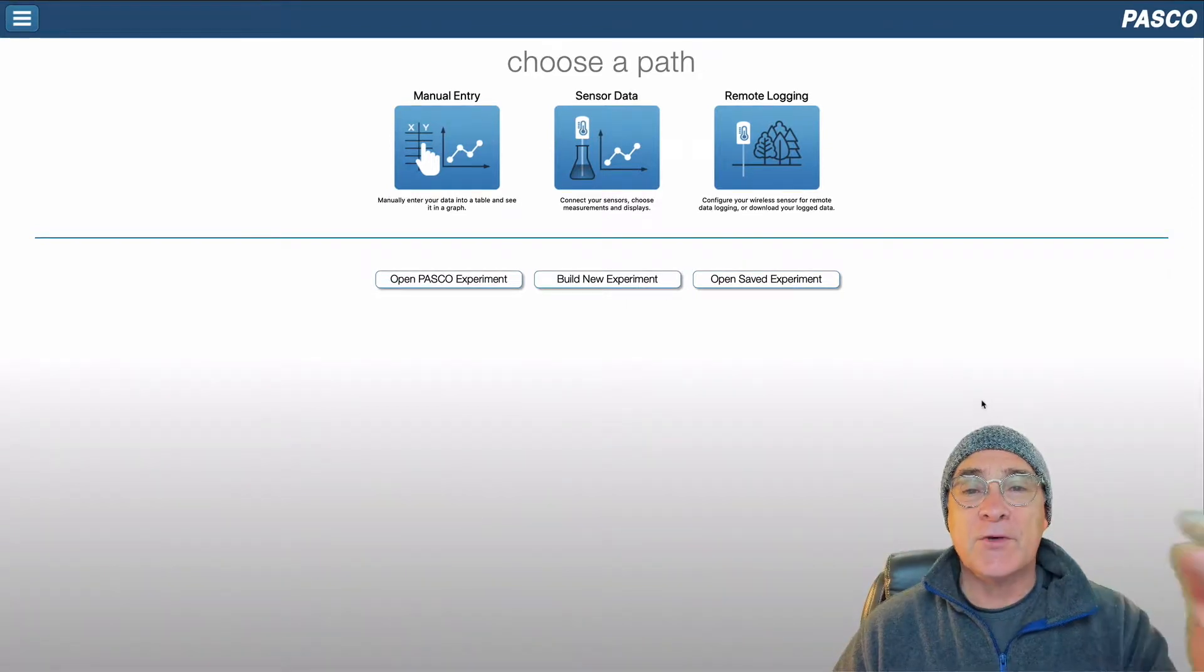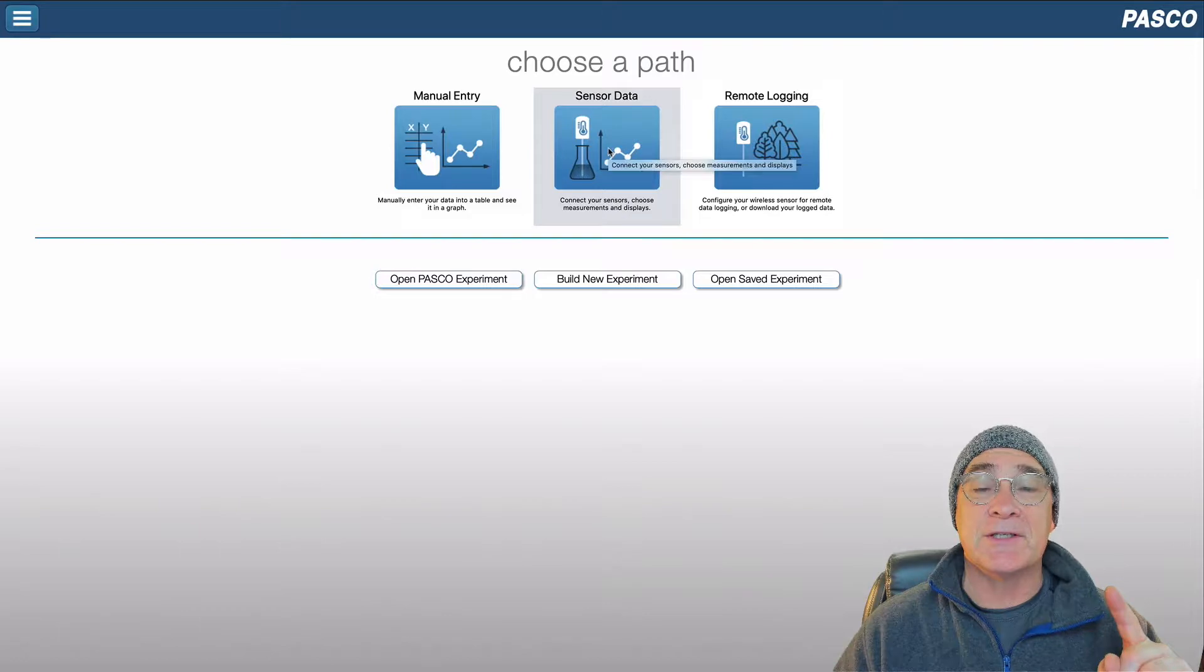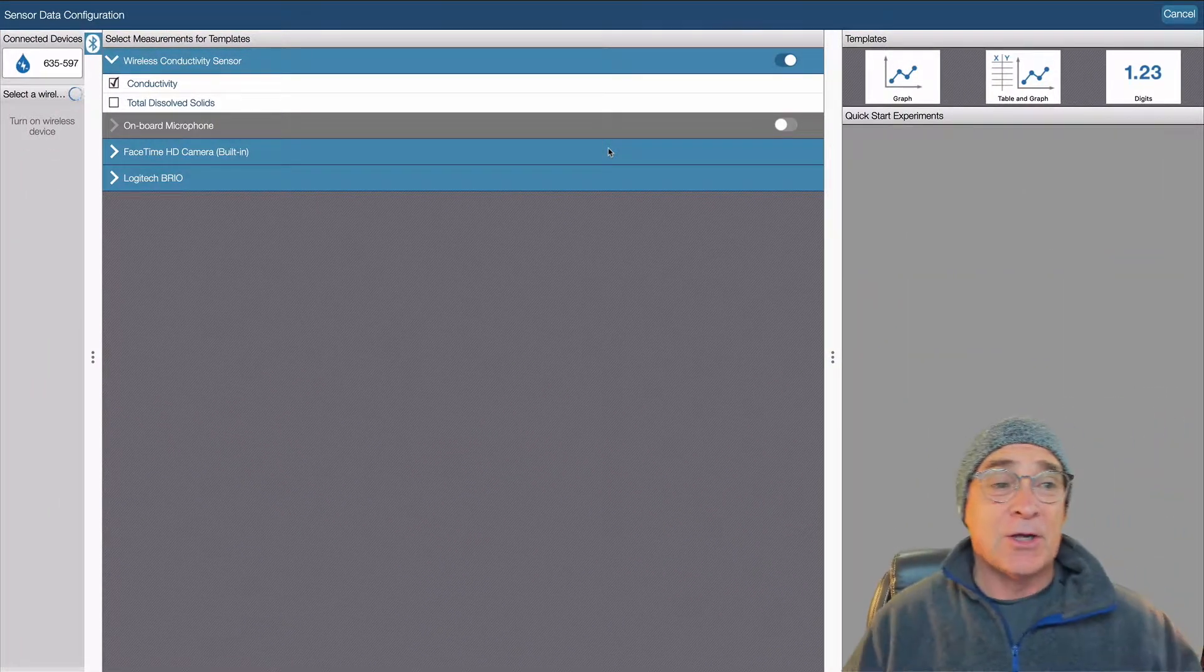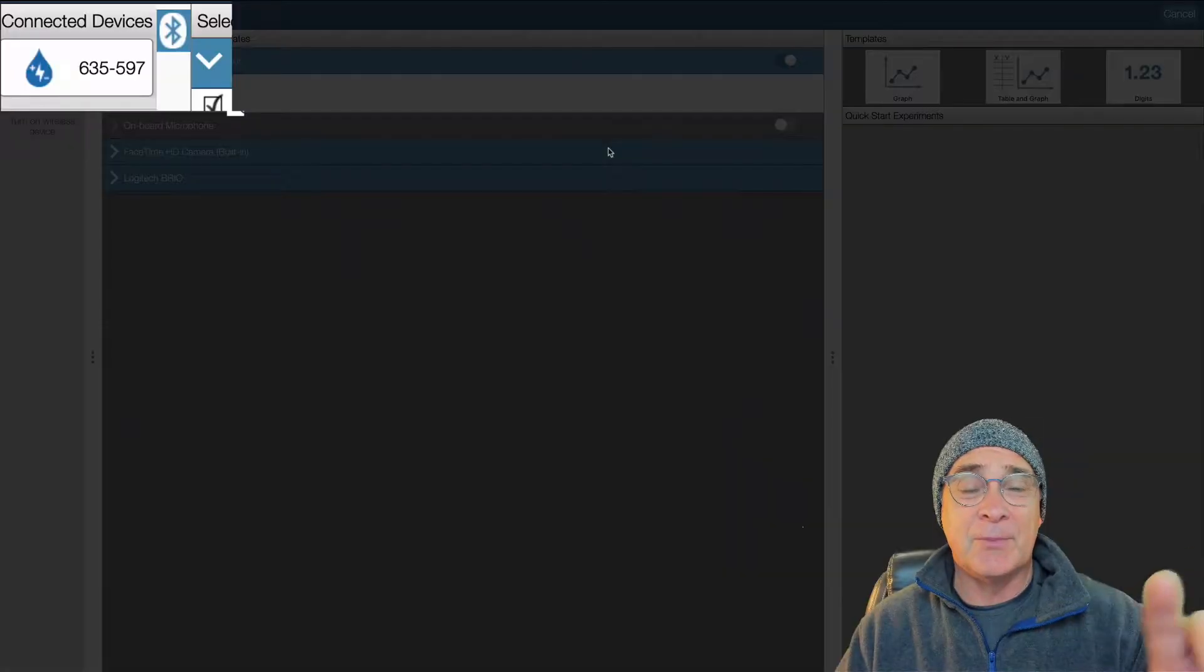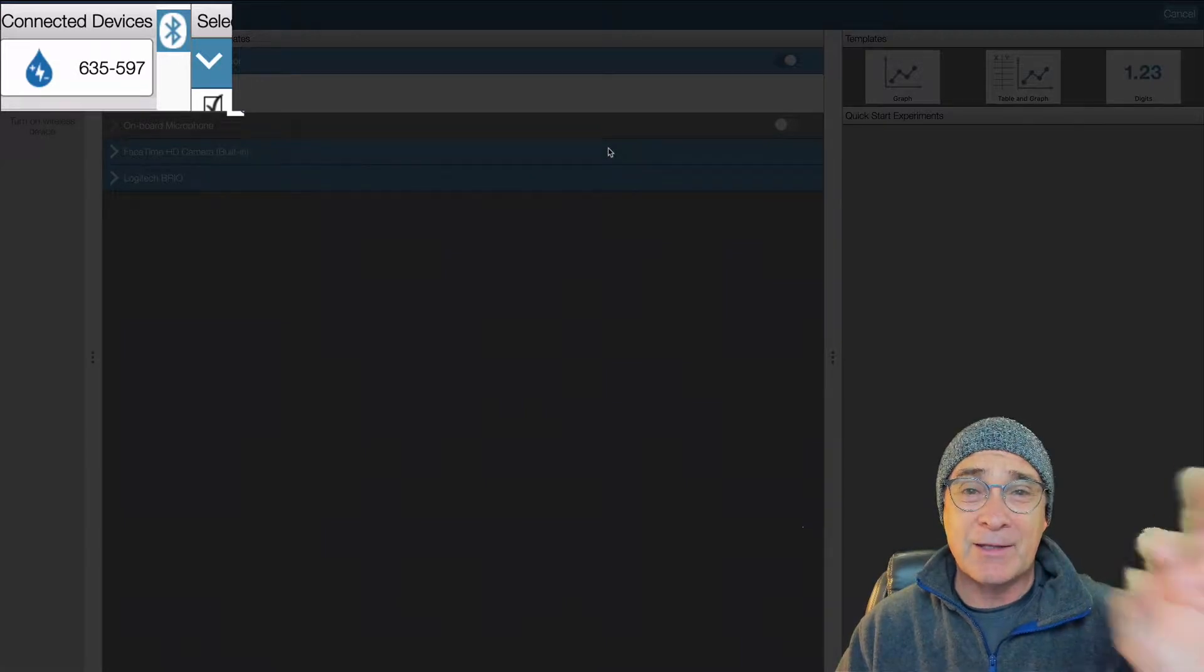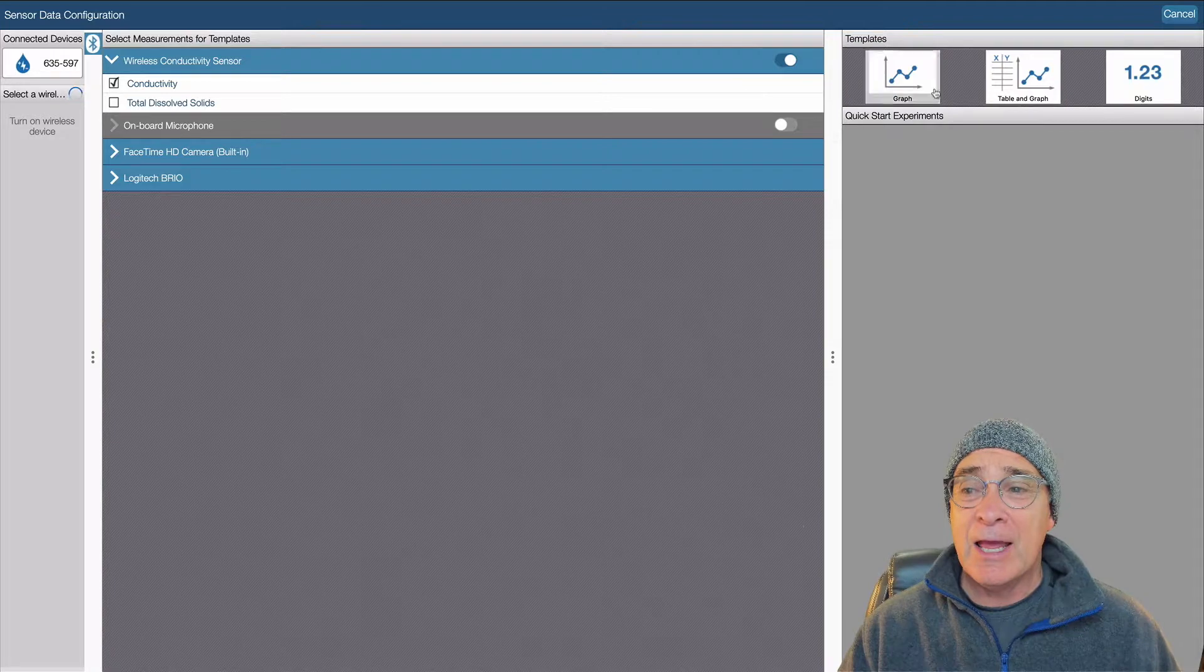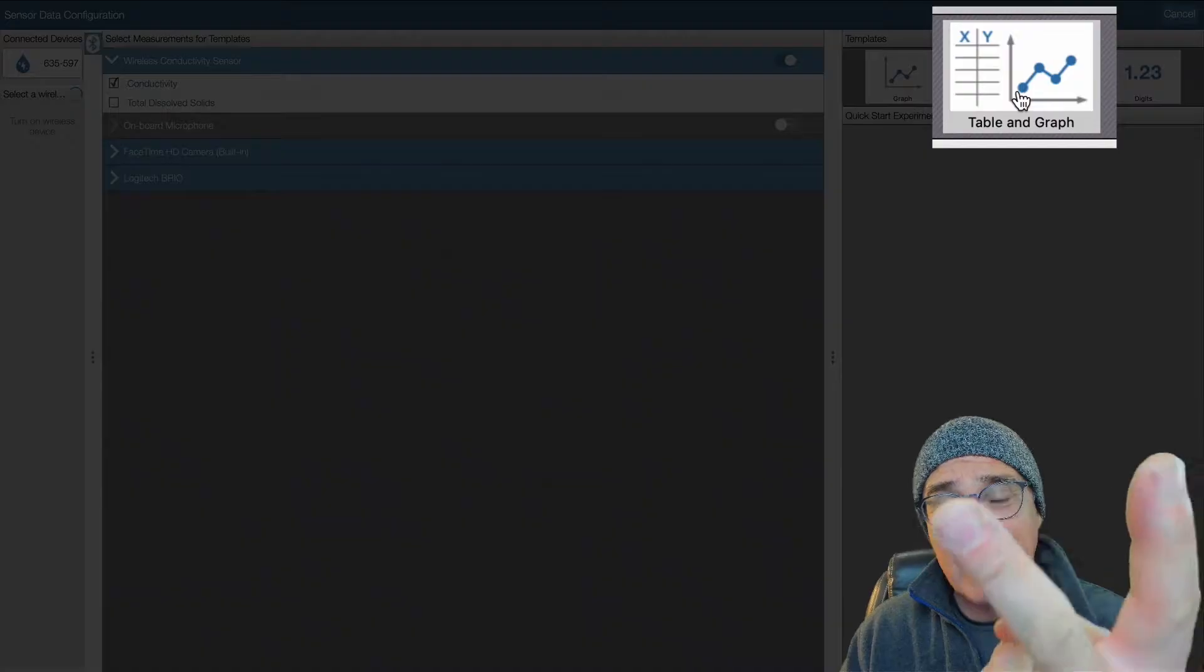The first thing in setting up the software, we're going to click on where it says sensor data. Now I've already paired the sensor on it. So what you want to do is just look on your left-hand side once you have clicked that middle button. And it says it definitely is paired. And then what you want to do is get a table and get a graph.